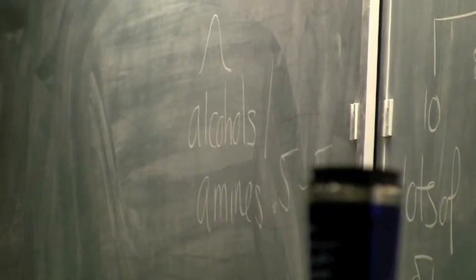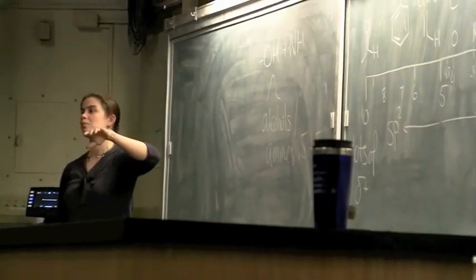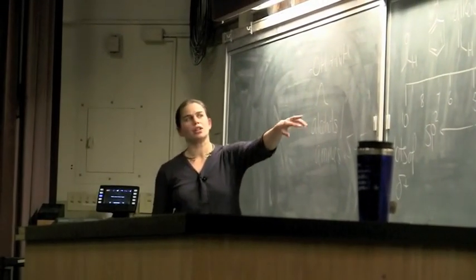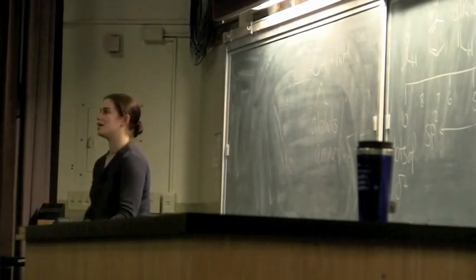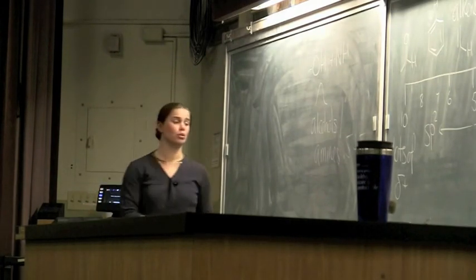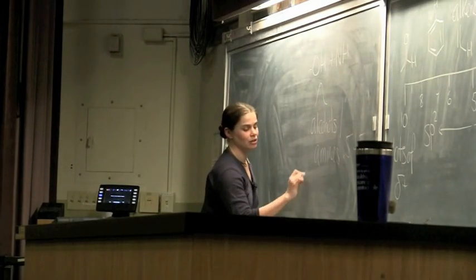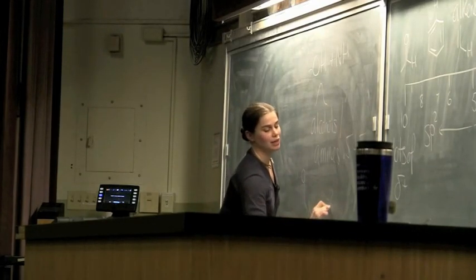We won't see this so much in 118A, but keep it in the back of your brains for the next couple of quarters. When we start getting stuff with pi bonds, stuff attached to benzene, attached to an amide, next to a pi bond of some sort, and we turn that into an sp2, amides tend to show up between 6 and 8 ppm.